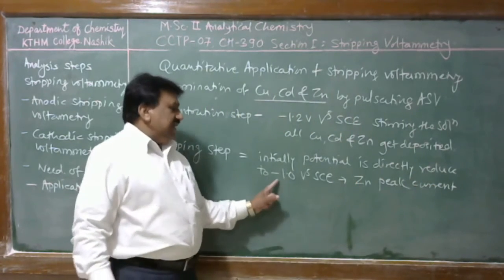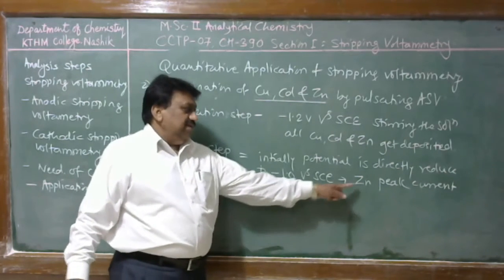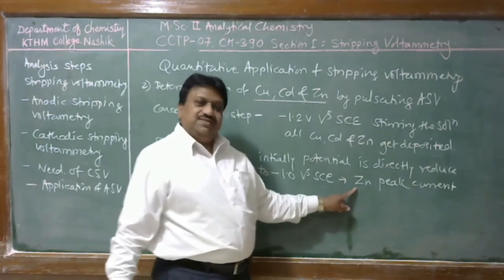Here potential is directly scanned to minus 1.0 volt, where an oxidation current for zinc is observed.